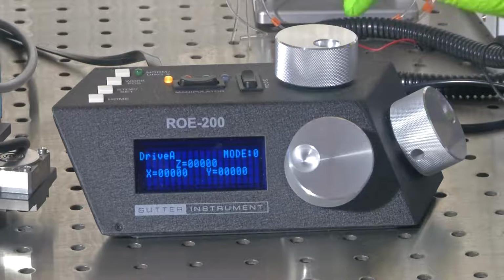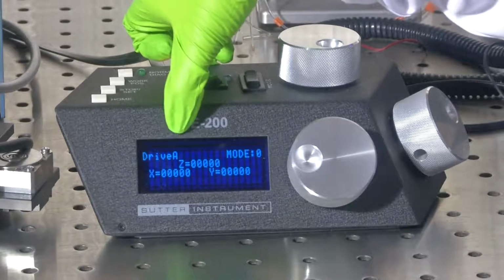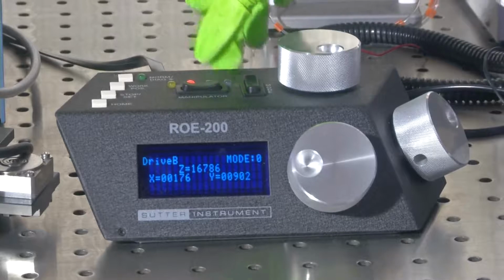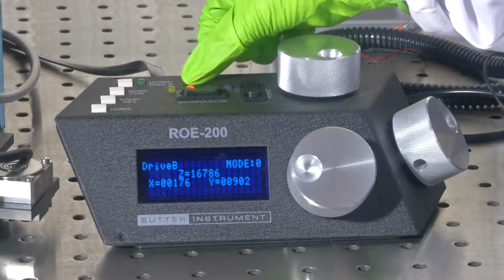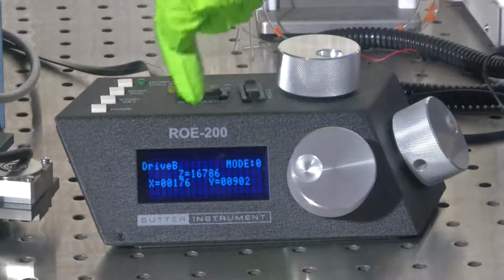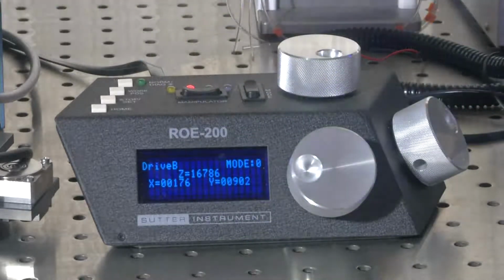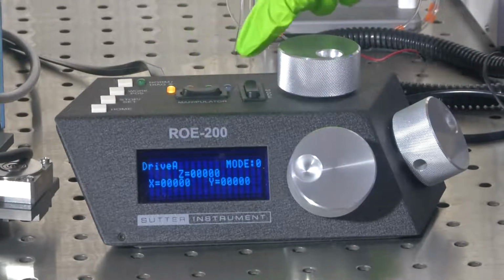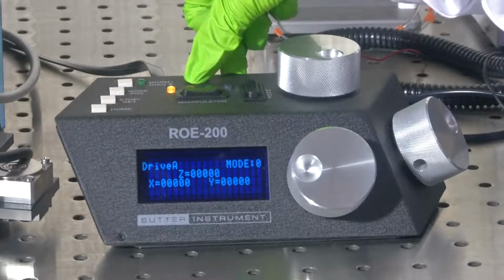Now say I would like to switch from manipulator A to the second one. Now here, the second LED glows, which indicates that the control unit is now displaying the XYZ position of the second manipulator, in our case B. So, as you can see, we have only 2 active manipulators connected to our control system.